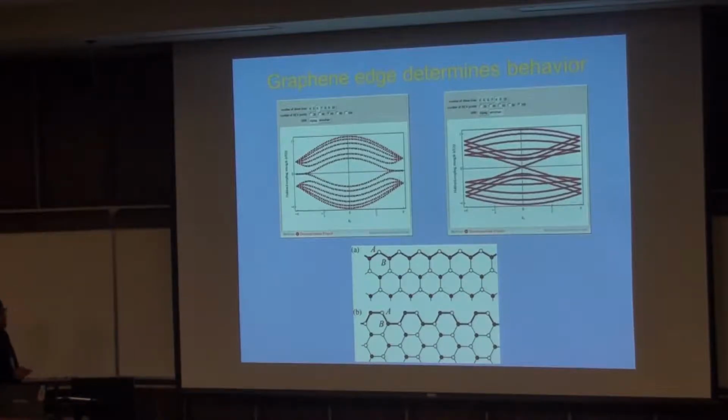So here are two diagrams of the band structure of a graphene nanoribbon with a zigzag edge right here and with an armchair edge right here. As you can see, the electronic profile is wildly different depending on the edge. So maybe, if we take a graphene nanoribbon with a complex edge, perhaps we can push the electronics to a degree which will create a lot of sensitivity and interesting effects as the DNA is passed through.